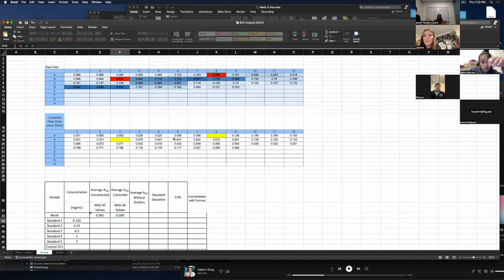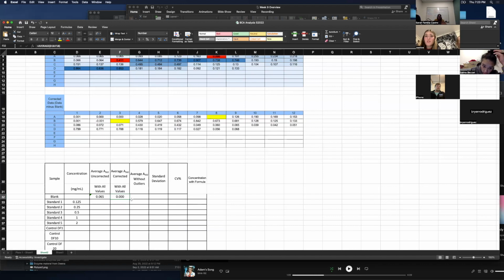Okay, yep. And then return. So we're going to do this again, grab the bottom right. Excel basically just did the same thing as before. We copy and pasted that cell ID information down 1. So it's literally saying you want the average of the 3 cells, 1 below where they were before, which isn't what we want, right? Because standard 1 is over here in A4, A5, and A6. So just go ahead and grab it, move it over, hit return.